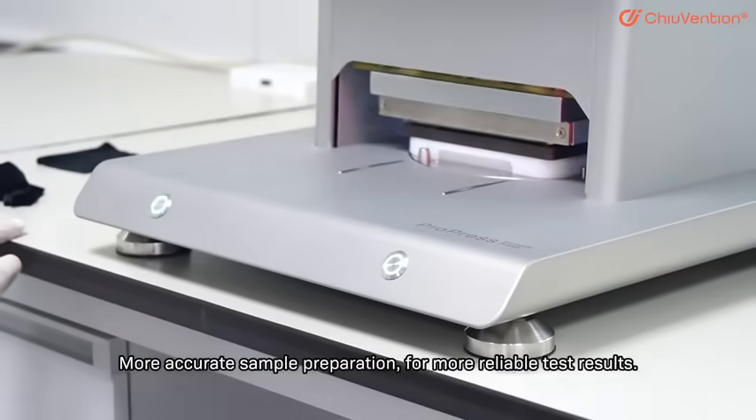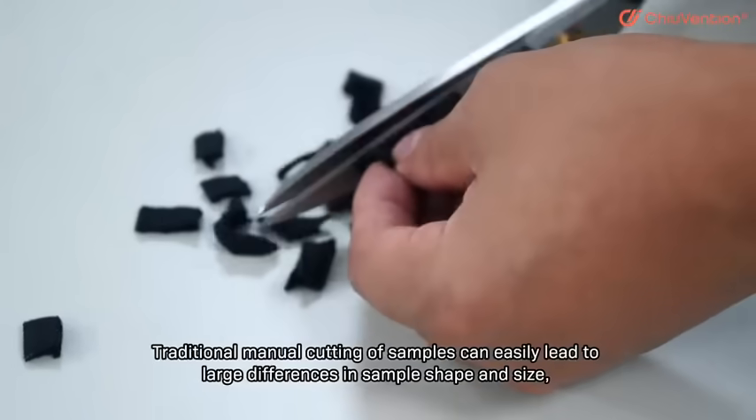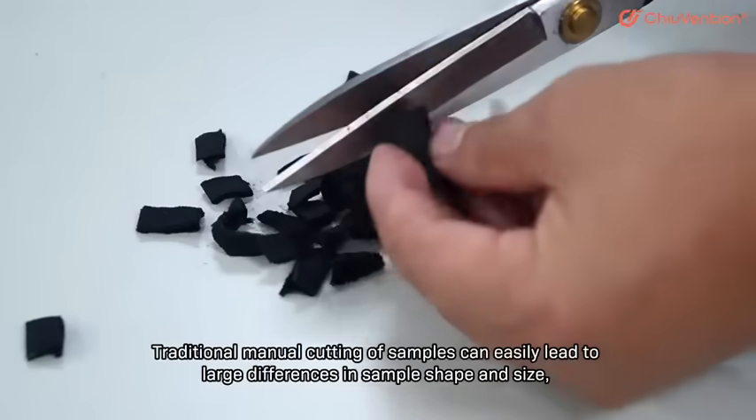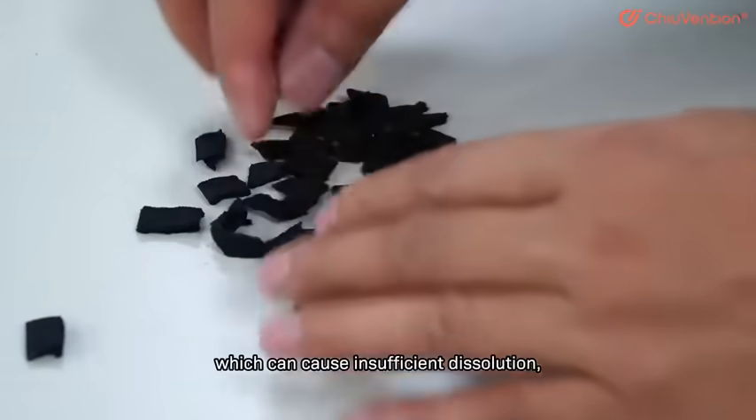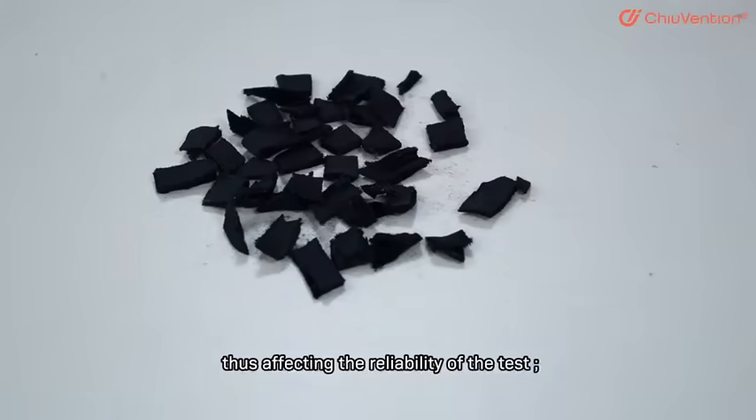Traditional manual cutting of samples can easily lead to large differences in sample shape and size, which can cause insufficient dissolution, thus affecting the reliability of the test.